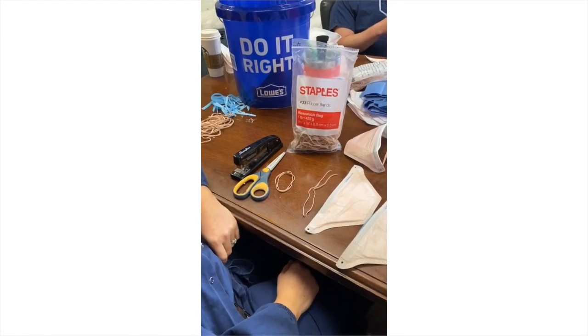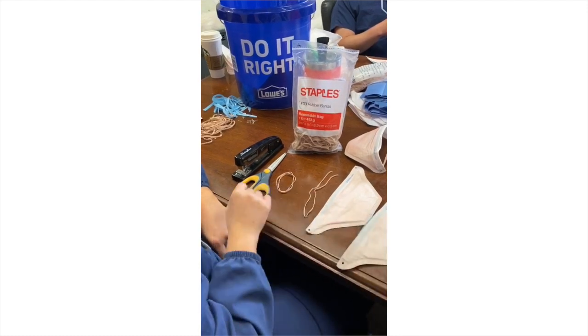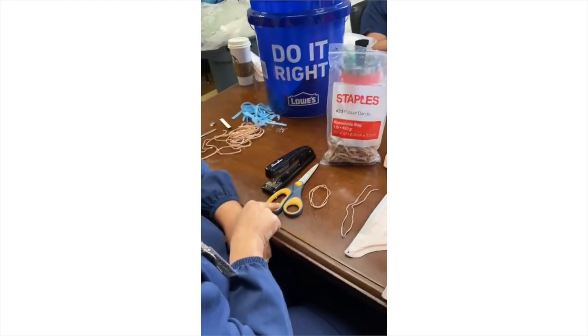Hi, here's how to repair an N95 mask if your straps are dry rotted or broken. You'll need two size rubber bands, 33 or 34 size, a stapler, scissors, and a hole puncher.